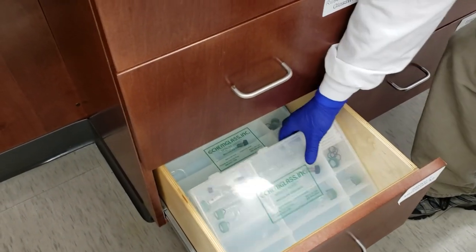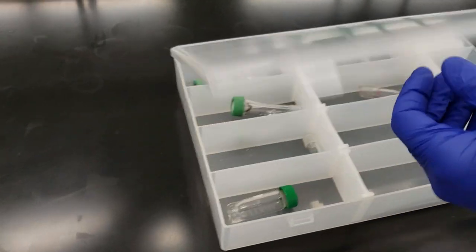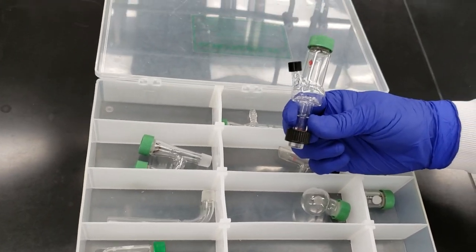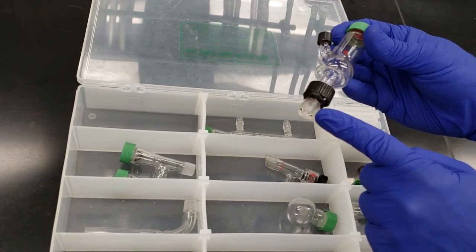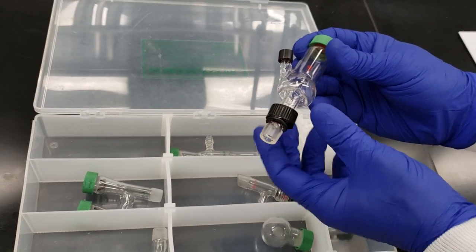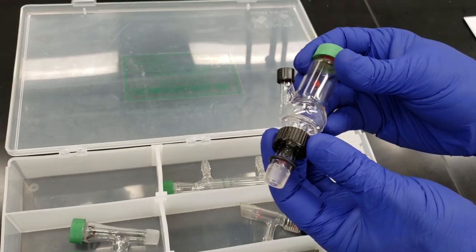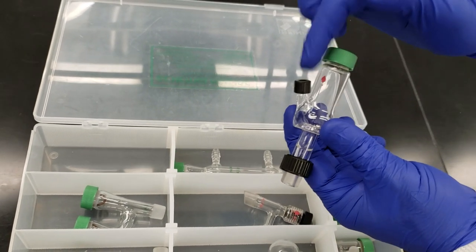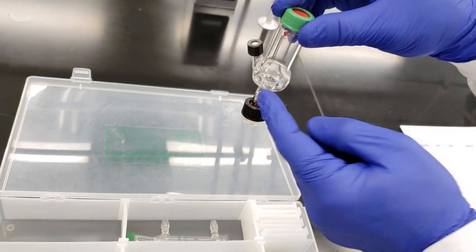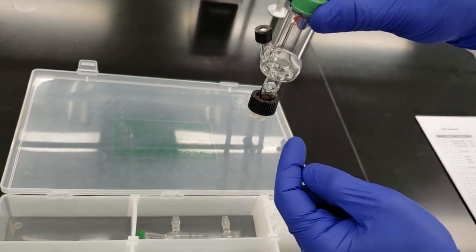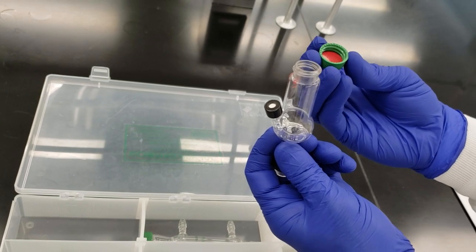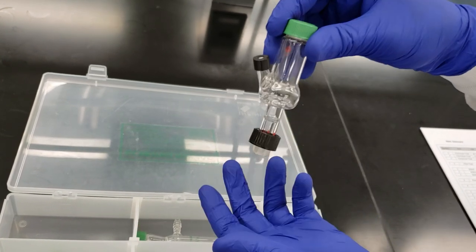Let's look at drawer three, our microscale kits. There are two kits per station. We have our Hickman still head with ground glass joints and O-rings, with screw caps to attach to conical vials and round bottom flasks. It has a side arm so as vapors come up and condense, we can collect using a needle or pipette. We can attach a thermometer adapter to the top or seal the system with the screw cap.